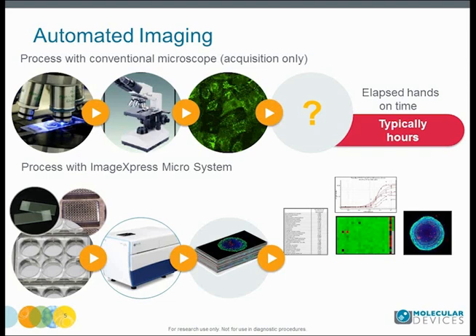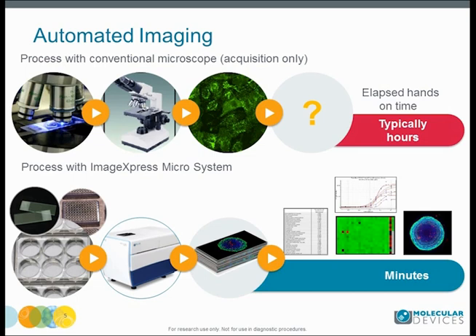Now with high content screening, you can acquire a wide variety of assays. You can acquire those different applications from slides, from 6-well dishes, from 384-well, from 1536-well plates. You acquire it fast at very high throughputs. You have image analysis that can happen in parallel, at the same time as acquisition. And you can turn those numeric data into meaningful results.